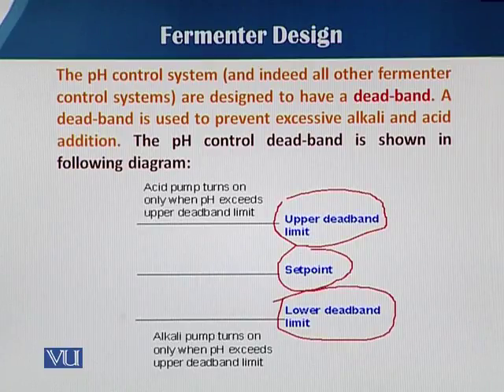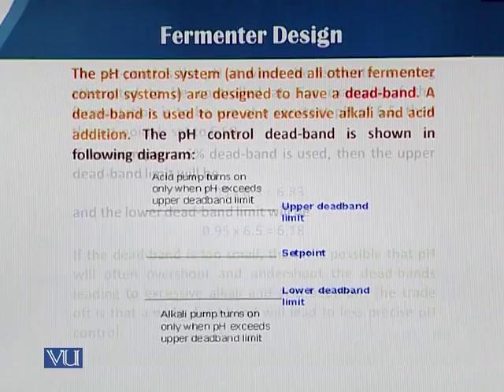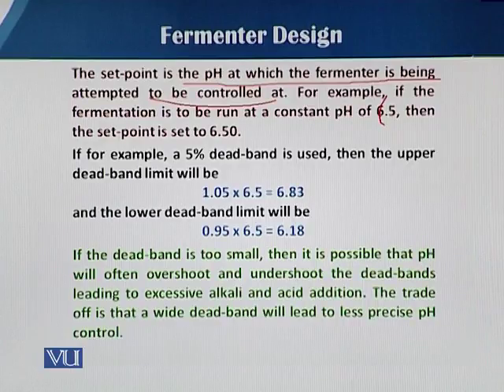So how can we place the upper band and the lower band? In a later slide you can see how we decide the upper band and the lower band with respect to the set point. The set point is actually the pH at which the fermenter is being attempted to be controlled. In this example, if the fermentation is to be run at pH 6.5, then the set point is 6.5, and we want to set a 5% dead band. Dead band means the range in which no pump, either acid or alkali, will be switched on or off. So that 5% is our dead band.